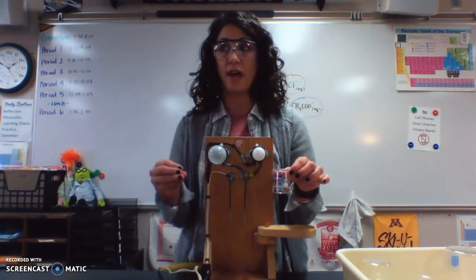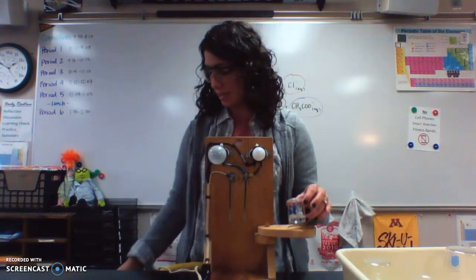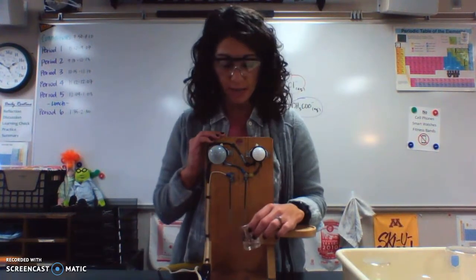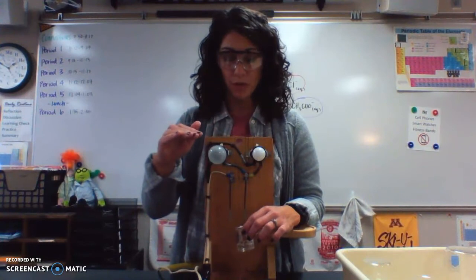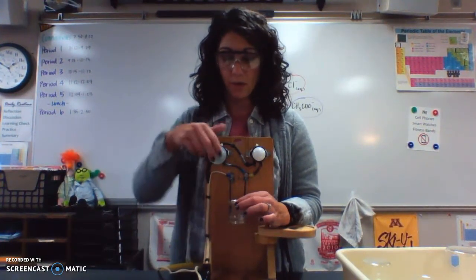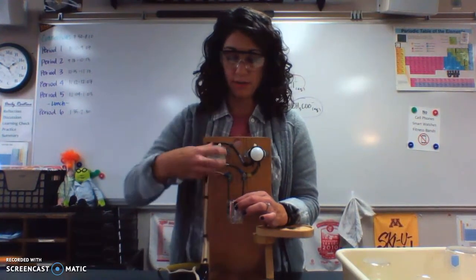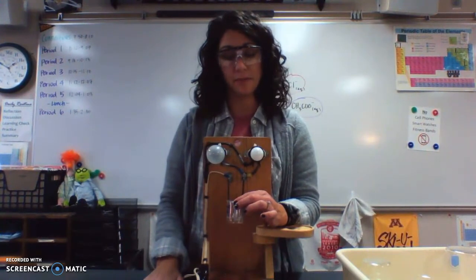Acetic acid you have at home as vinegar. At home it's probably 5%. That's typical vinegar concentration. This has 0 water. So this would be like 100% acetic acid. So acids are made of ions, but this is a non-electrolyte.